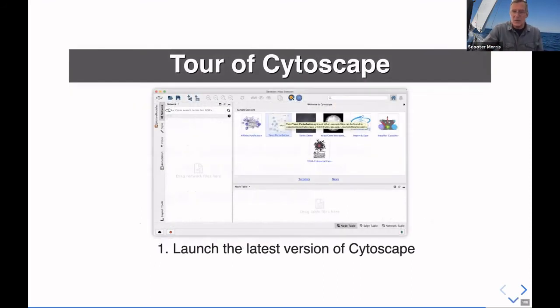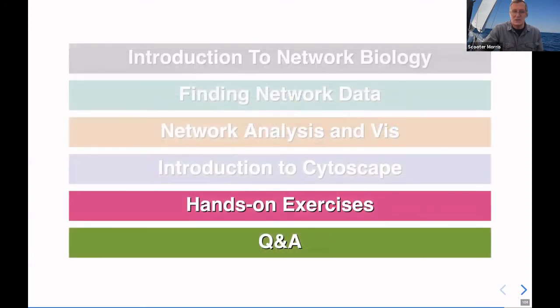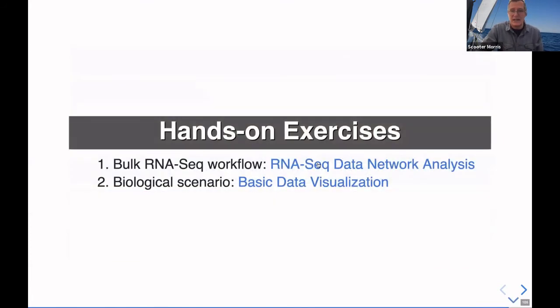A little bit about Cytoscape. I think we'll just jump right into the hands-on exercises. How are we doing on time? Not bad. So here's the exercise.